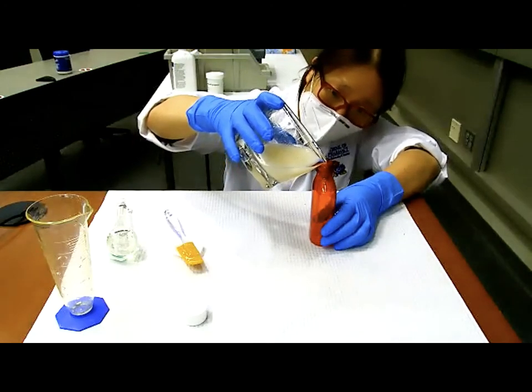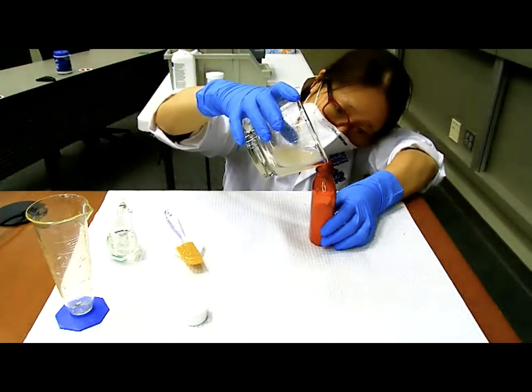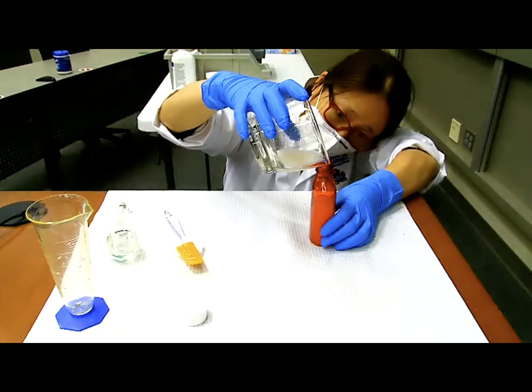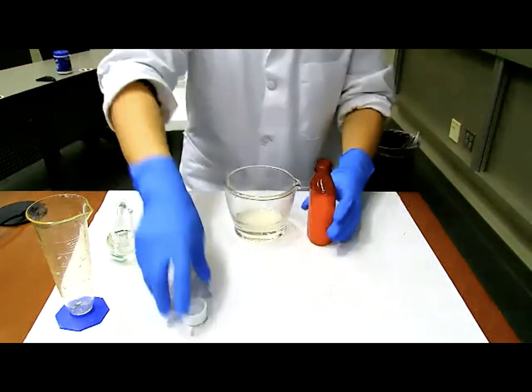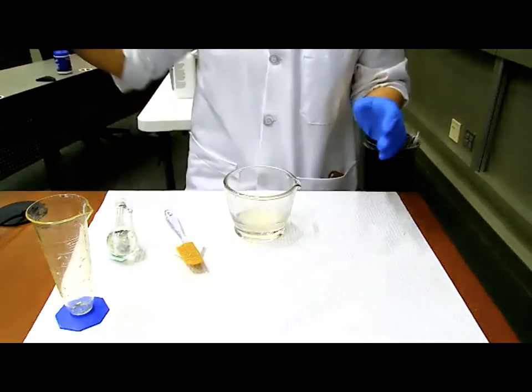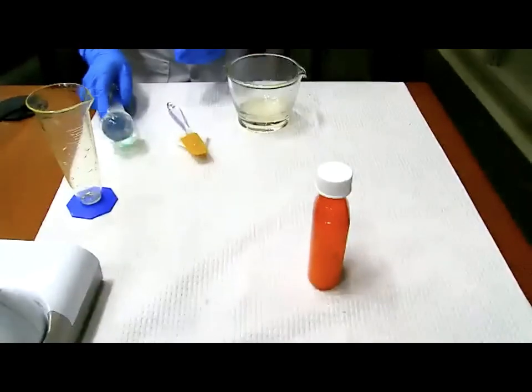Again, pay attention to how I'm standing here. I'm really bending myself, so my eyesight is about matching the surface of my liquid. Okay, that looks perfect. All right, so we're all set. And shake well before we dispense. Okay, all right. Very good.